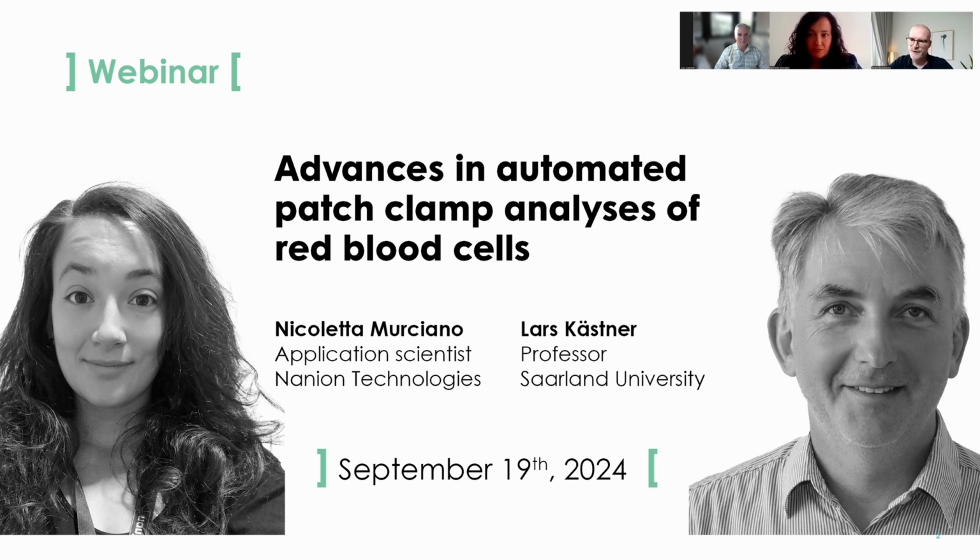Okay, thanks a lot. I will probably ask one question myself, very interesting about this action potential. So, Lars, have you ever heard about this phenomenon like pseudo action potentials in other non-excitable cells? I understand that it's related to Gardos stochastic behavior, but maybe we can think of it in some other cells. Well, I don't know.